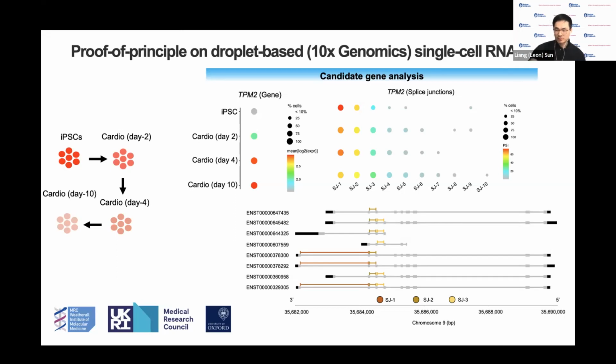So the first question I have is maybe a general question. Can you tell us when should we actually consider single cell RNA splicing analysis? Usually we do bulk RNA-seq or single cell RNA-seq, the general analysis, identify the cell types and then do the differential expression analysis. Could you give us some guidance on which case we should do single cell splicing analysis?